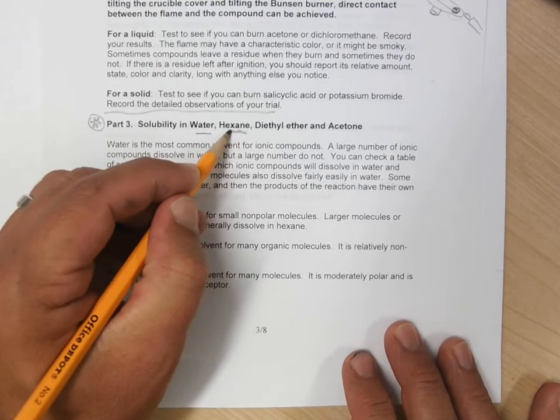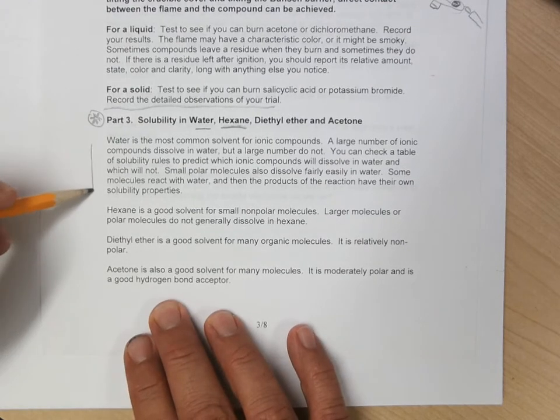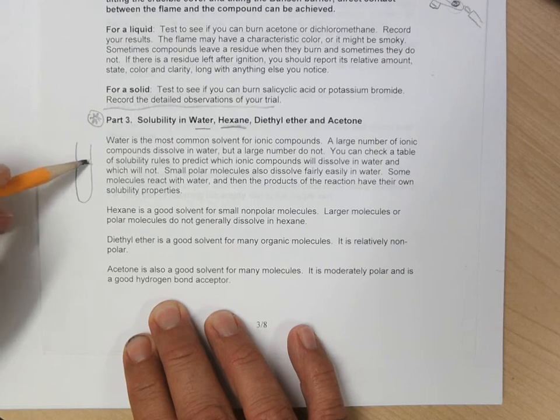Hexane is a nonpolar organic solvent, which has certain properties for dissolving molecules, and the way we would test the solubility is we would get a couple of milliliters of the solvent, and then we put a few drops, a smaller amount, of what we're trying to dissolve, if it's a liquid.